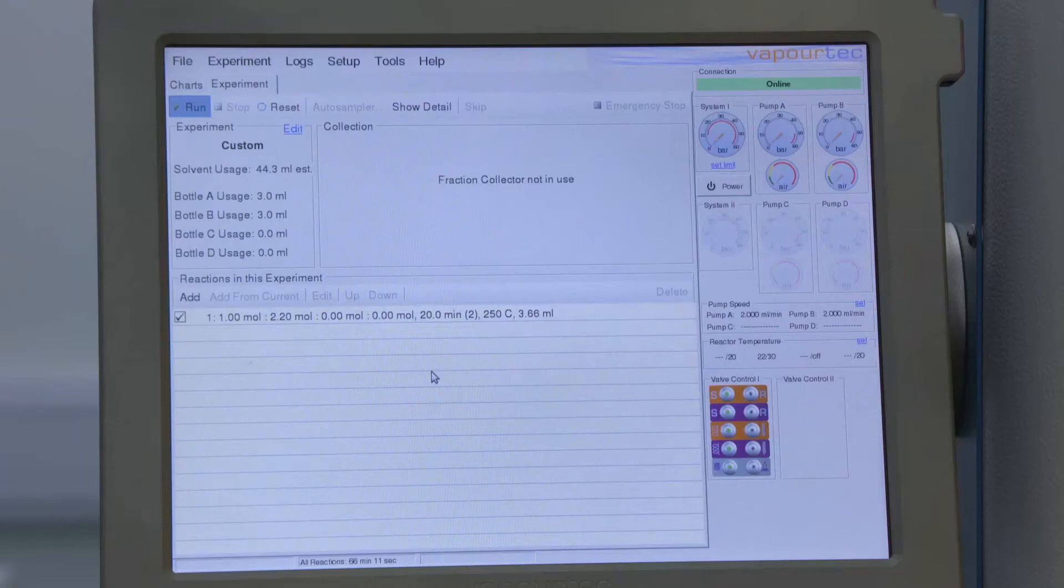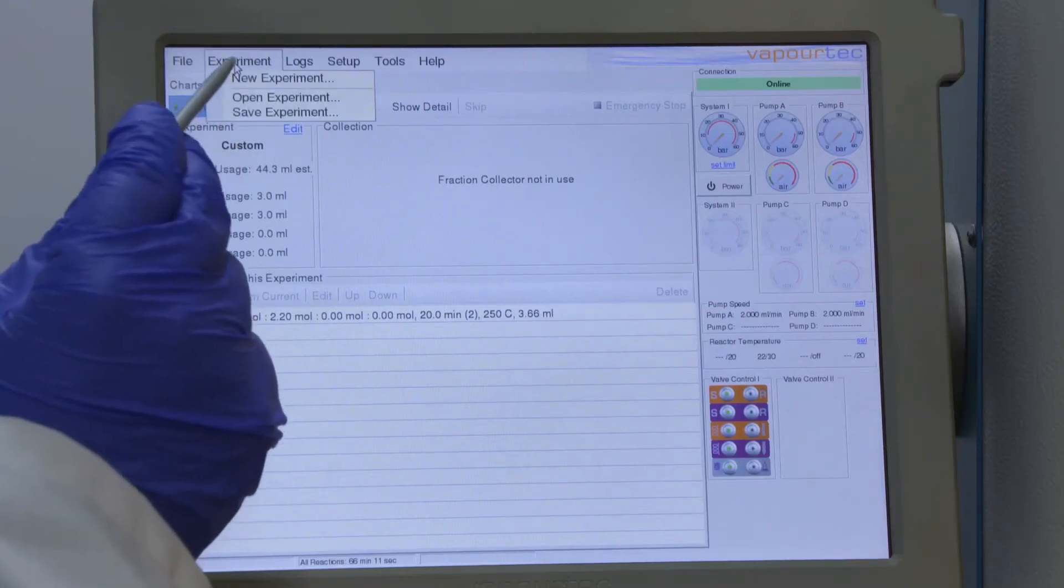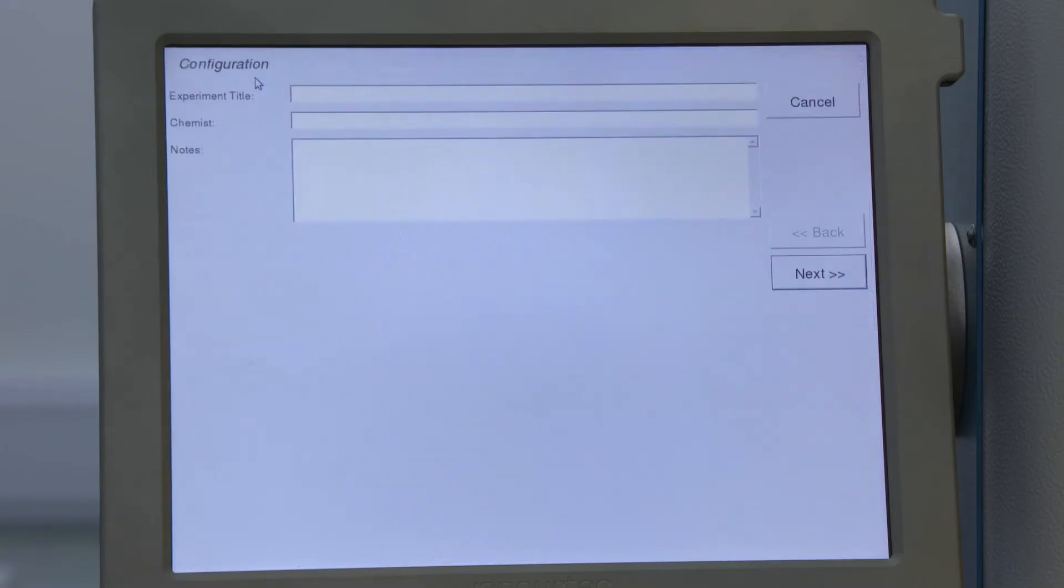Now that the system's ready I can program FlowCommander to run the experiment. To do that I open a new experiment. I have the opportunity to fill in some information about the experiment here.